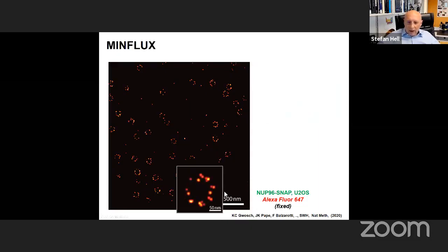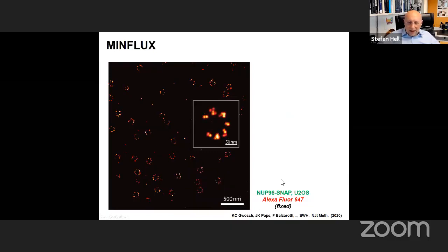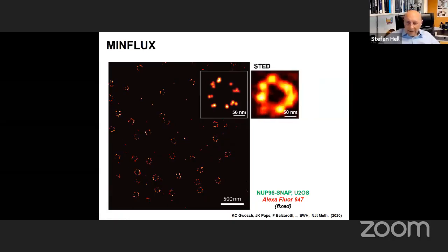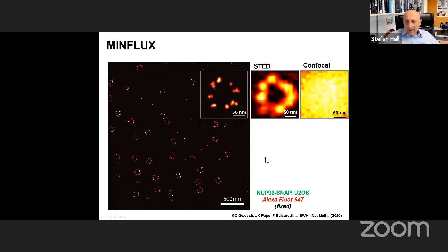And if you zoom in, of course, there is every reason to believe that individual localization groups, as you can see in here, can be associated with fluorescent molecules, nothing else. Very clear. The labeling determines what you actually see. And this is clearly much better than what you have instead with confocal. There's an order of magnitude in between, and arguably right now probably the best images that there are, so to speak, in far field fluorescence microscopy.